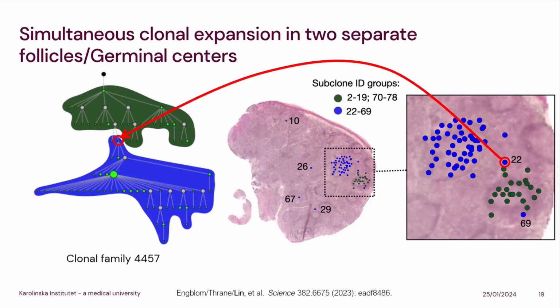For example, we extend our method to a breast cancer patient, and we found the tumor adjacent clones that are close to the tumor area. And we developed tools, because since it's a spatial method, it's not at the single cell level, but we can use the spatial patterns to pair the light chain with the heavy chain. It's called repair. And we also have another method, because we want to have a ground truth of what clones we have.